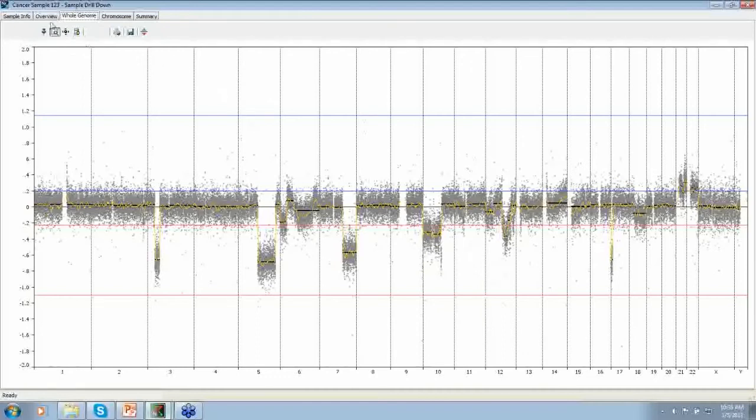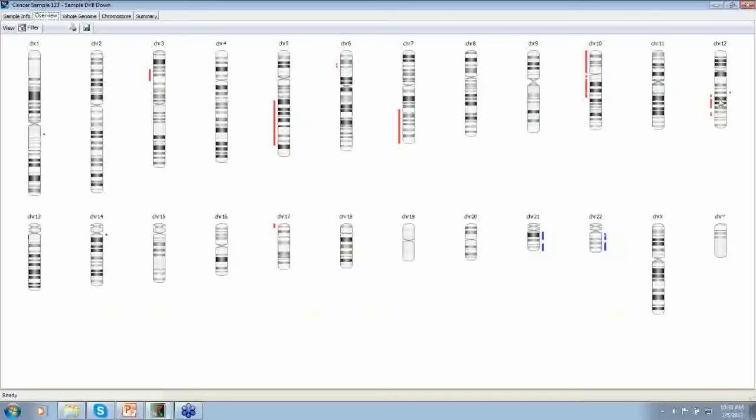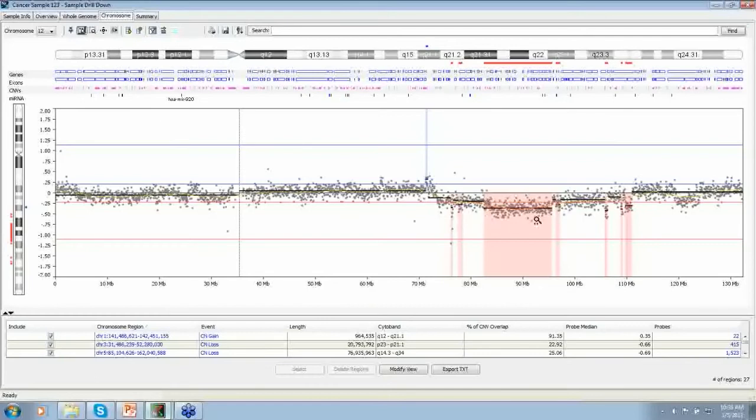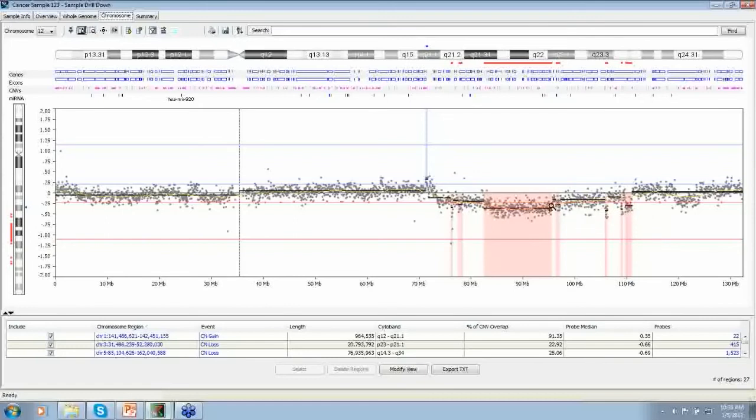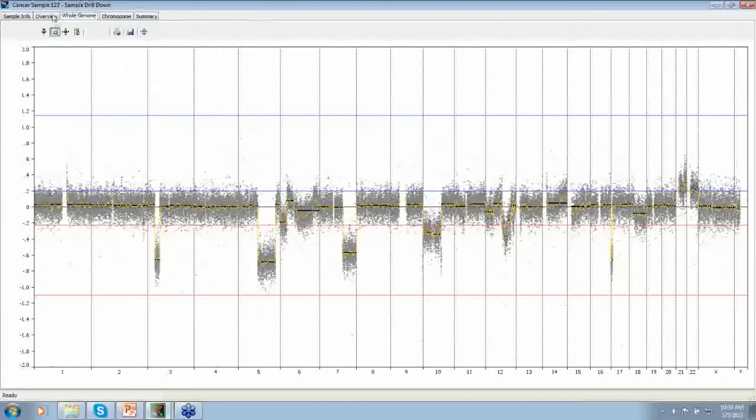So based on just the default settings, these are the calls that are made on chromosome 12, for example. It's a good case and I've used this before. This area is being called the loss but the flanking areas are just missing the threshold. So the question becomes at what level of mosaicism do you want to pick up these losses?